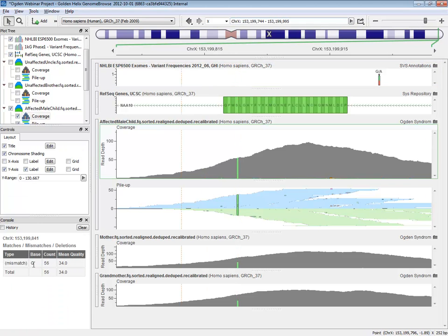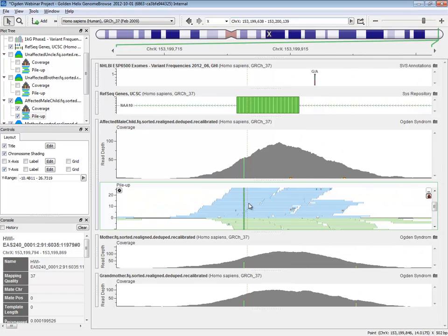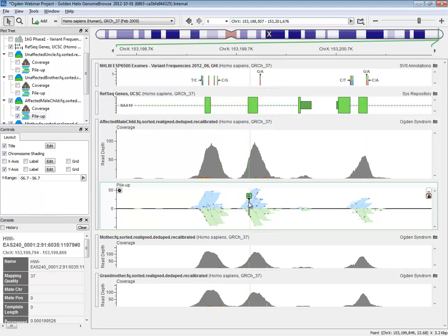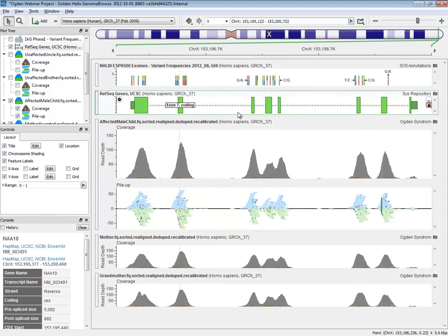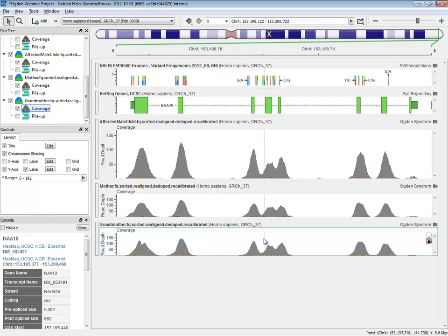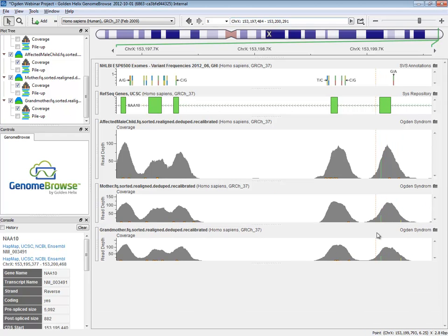We have 56 reads supporting the G. There's nothing else that would imply that this is a read we wouldn't trust. I can zoom into the base level and see the individual reads, and it's very clean. There's reads above and below the strand. I could zoom out and see the alternative exons. In fact, let's go ahead and zoom out to the entire gene level, and you can see there's no other variants for this sample. I'm going to go ahead and hide its pileup and show just that we have the mother and the grandmother, which are essentially in a carrier state. Those variants are showing up clearly as heterozygous, as we would expect. So the variant calling looks very clean here.